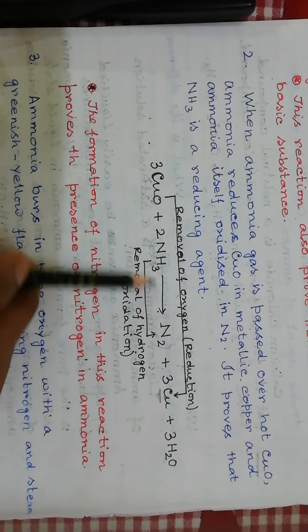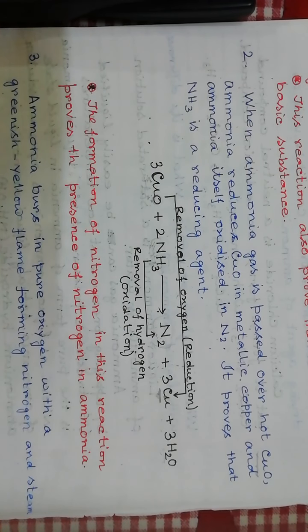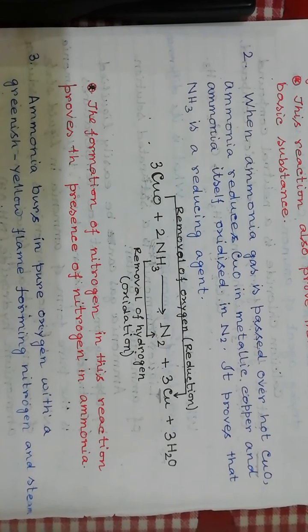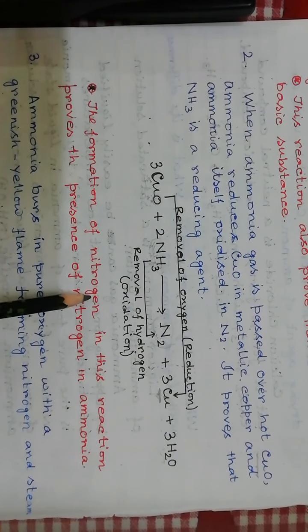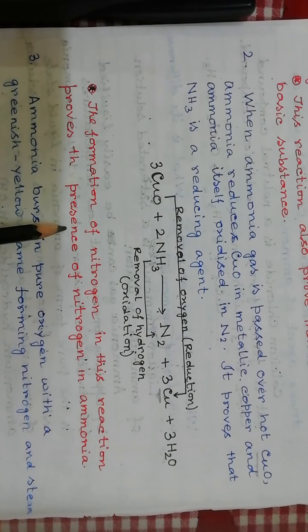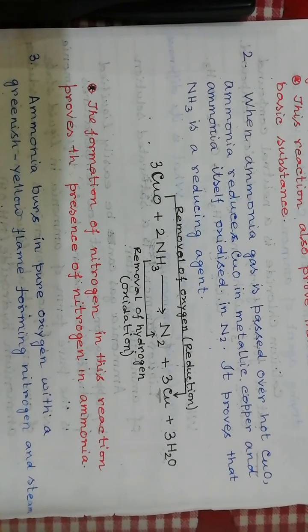In this reaction nitrogen is produced, and it helps to prove that ammonia gas has nitrogen. The formation of nitrogen in this reaction proves the presence of nitrogen in ammonia.